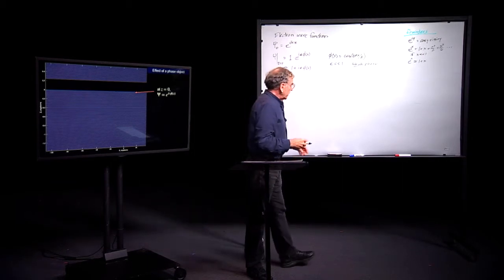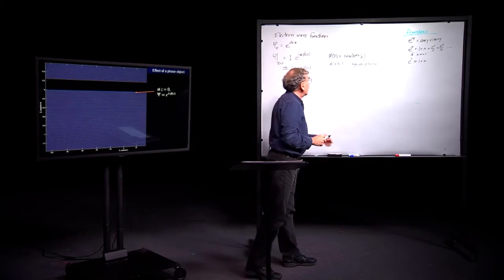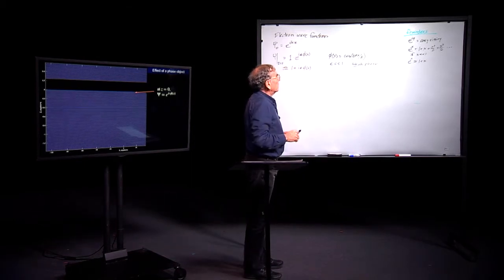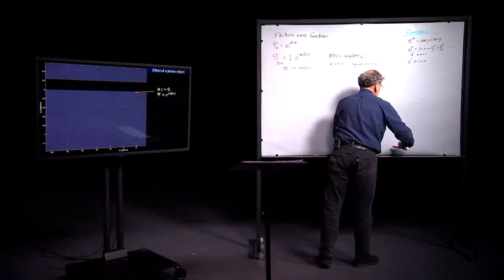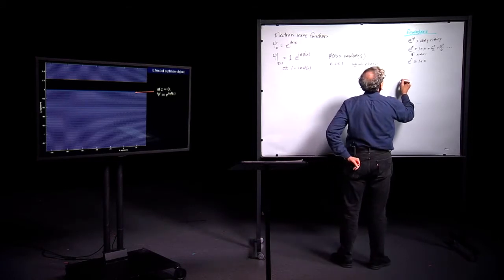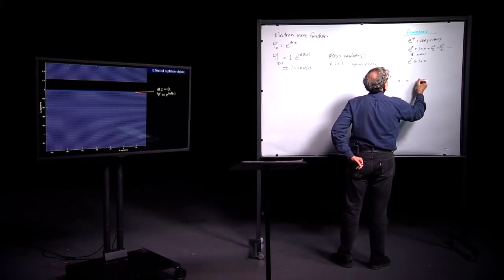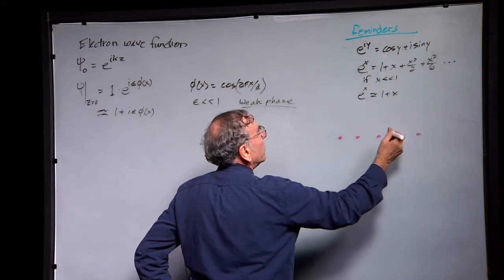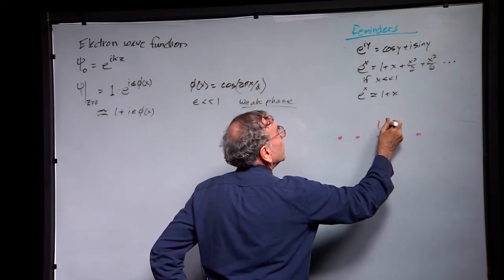And we're going to be able to get an idea of the wave function below the specimen by just thinking about diffraction. Our periodic phase specimen we can think of as some kind of diffracting object. Here's a periodic object with spacing d.